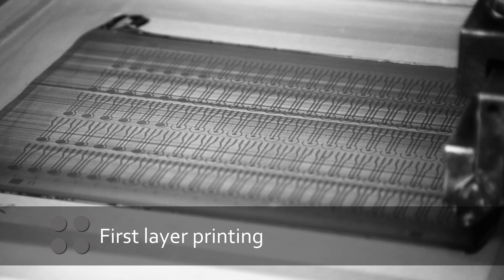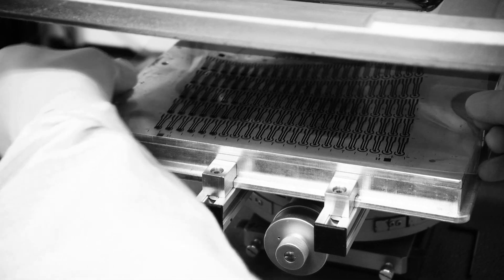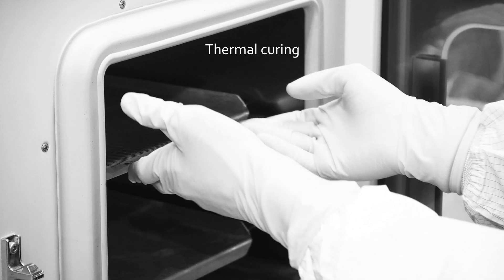The first layer of printing deposits conductive electrodes such as graphite paste with a resolution of 50 microns. CSCM's technology allows for high-throughput production with many sensors printed on one sheet. The meshes are then cured and prepared for the next layer of paste.